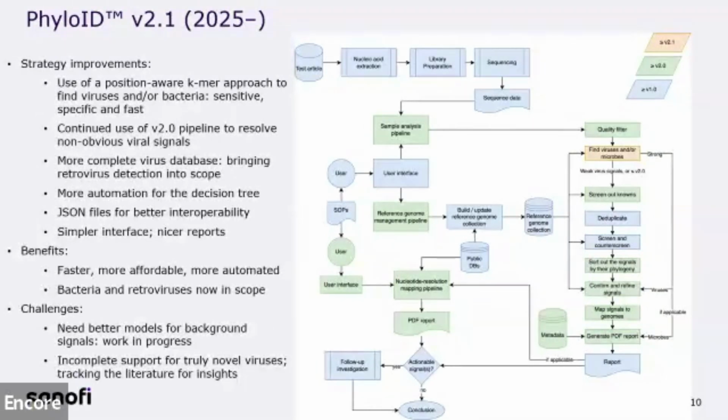And so we want to work on that. And then there were great talks in this conference about the novel viruses, the unmatched, and the potential approaches, machine learning and so on. And I'm seeing, I think, papers even more recent than the ones that were presented that offer really a lot of hope in terms of identifying viruses that are not well represented in the databases.